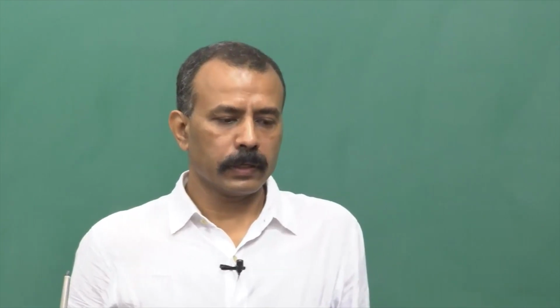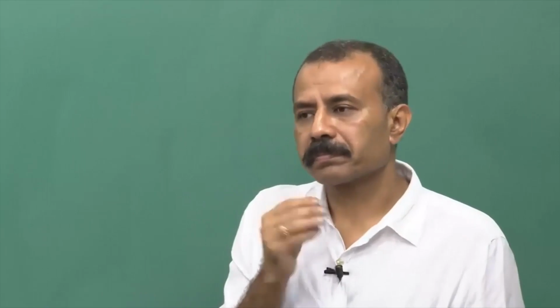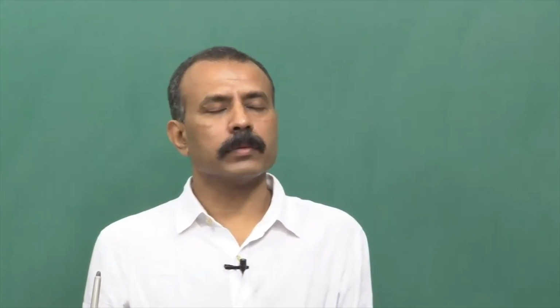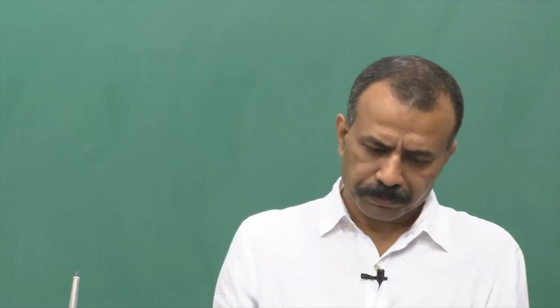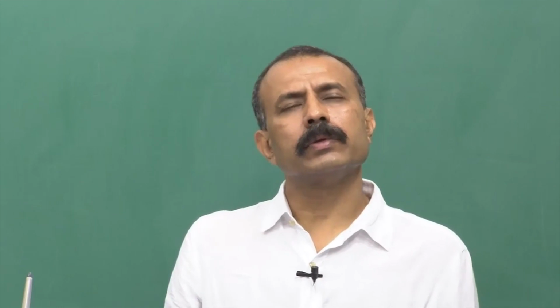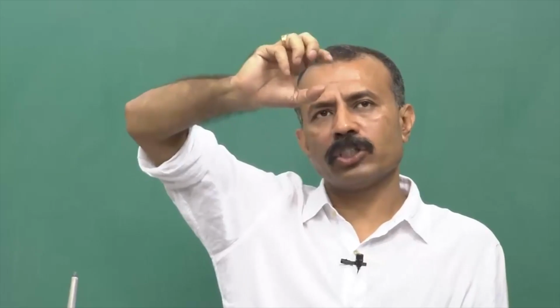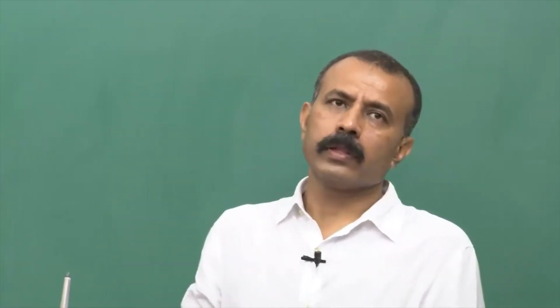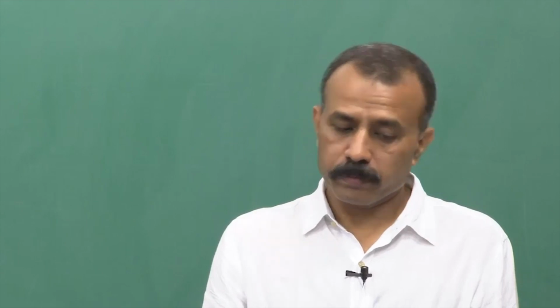Welcome to the lecture series in cell culture. For the last 2 classes we have been talking about how we can measure, using a micro cantilever system, the force generated by the myotubes. In the last class we talked about that if the cantilever bends and you have a way to measure the change in the angle of the cantilever, then you can do so. In order to do that, there are certain setups which are currently being used.